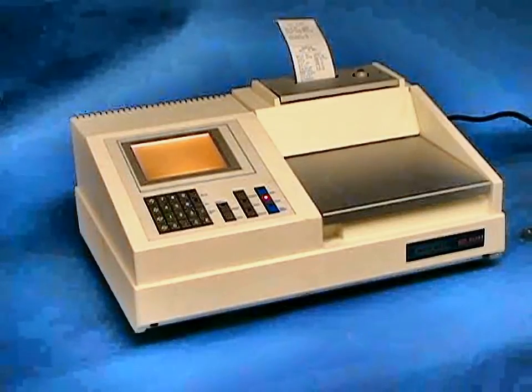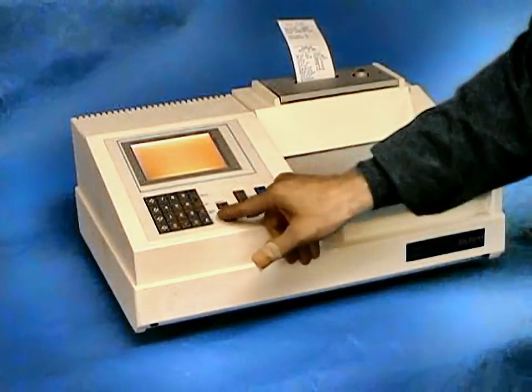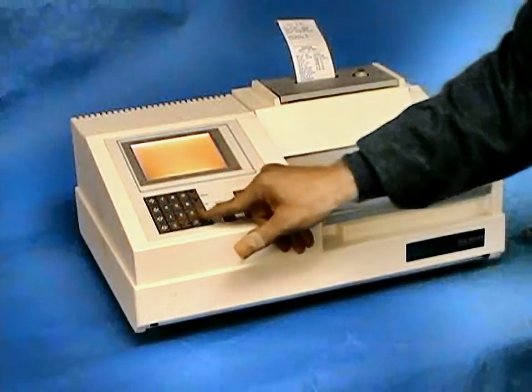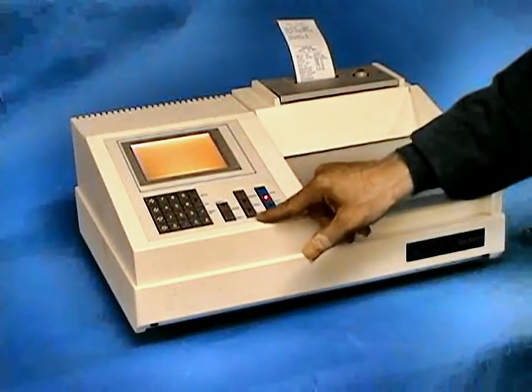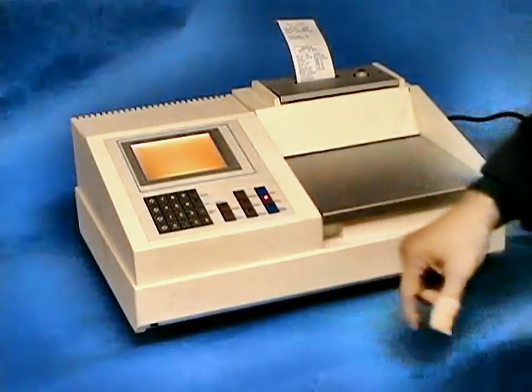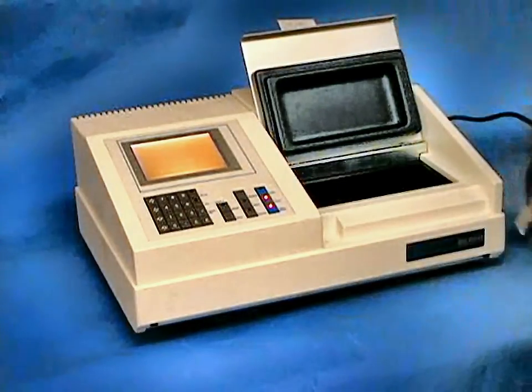Once this is completed and the internal calibration validated on the external printer, we can set our scale parameters for our sample — defining beginning wavelength, ending wavelength, our scan speed, our chart dimensions, our beginning and ending absorbances. The system will then prompt you to insert the sample and press the RUN key.